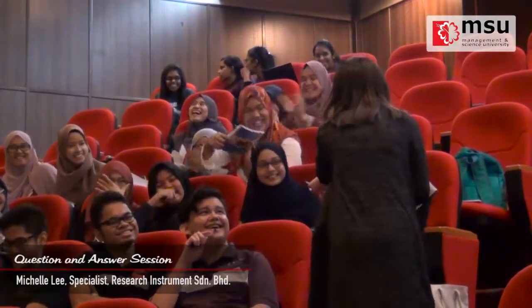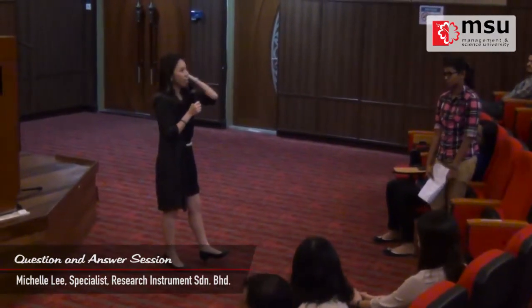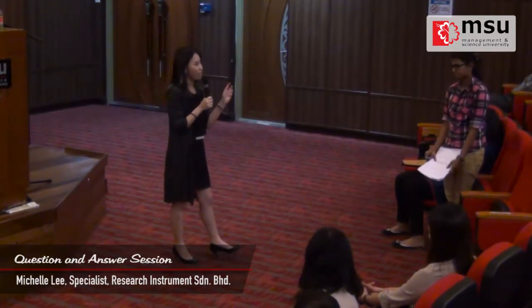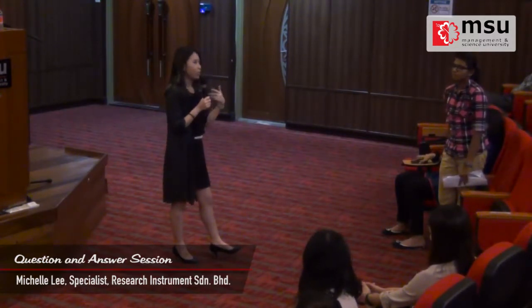From the green tea slides, we want to know which green tea is the best. So green tea is actually used for what benefits? Antioxidant? Antioxidants also come in various kinds. Which exactly antioxidant are you looking at? If you want to say which green tea has the best quality, definitely you're going to look into the antioxidant band. Because you already know this is the antioxidant, you can purchase the standard and run it together with the natural product. So at least you know which band is the antioxidant, and from there you can do the quantification.